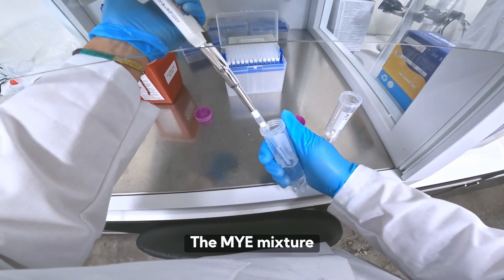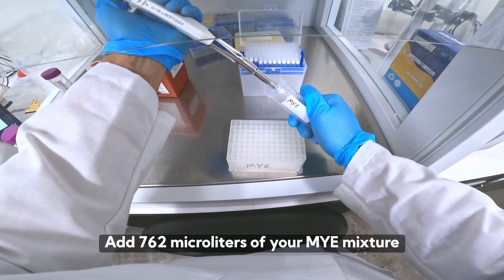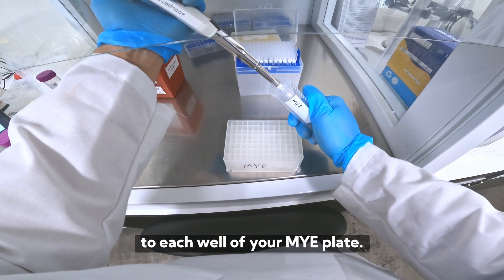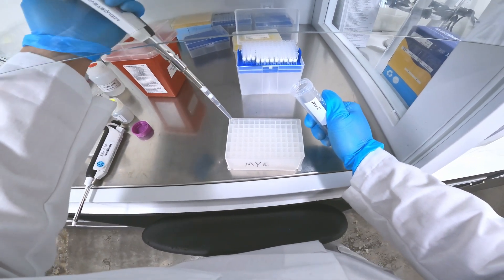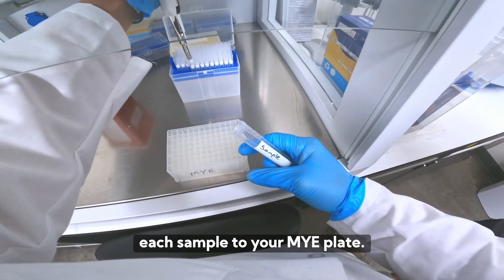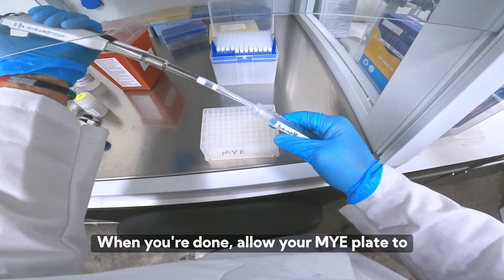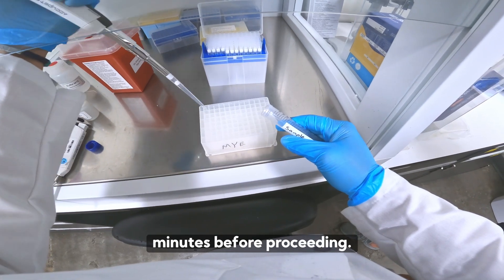The MYE mixture serves to lyse your sample. Add 762 microliters of your MYE mixture to each well of your MYE plate, then add 250 microliters of each sample. When done, allow your MYE plate to incubate for 10 minutes before proceeding.